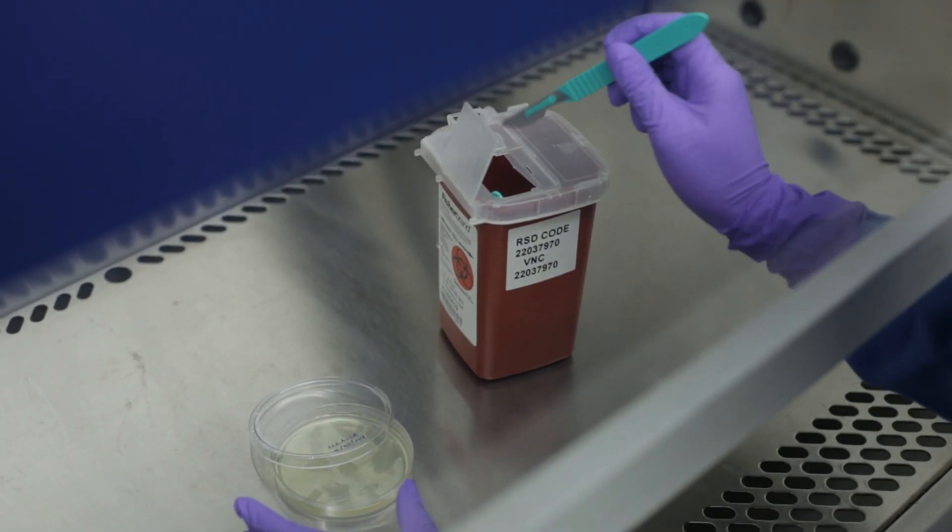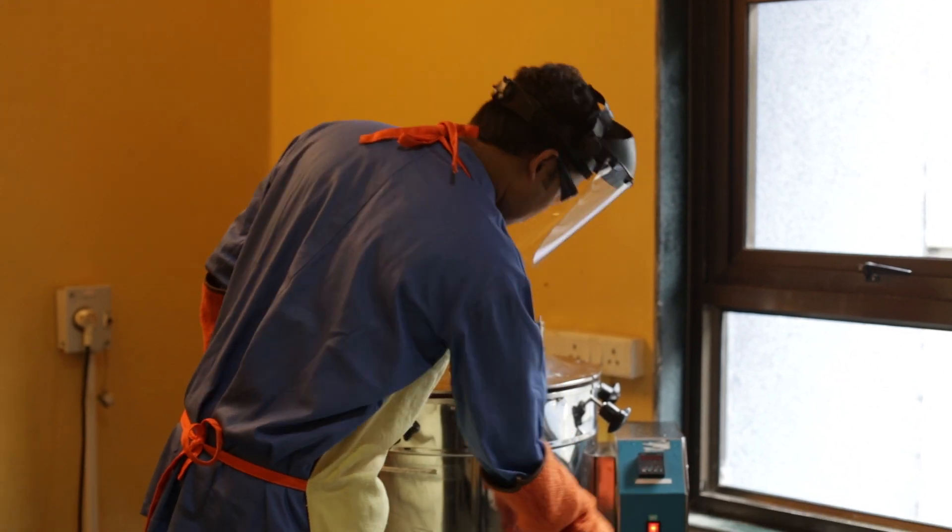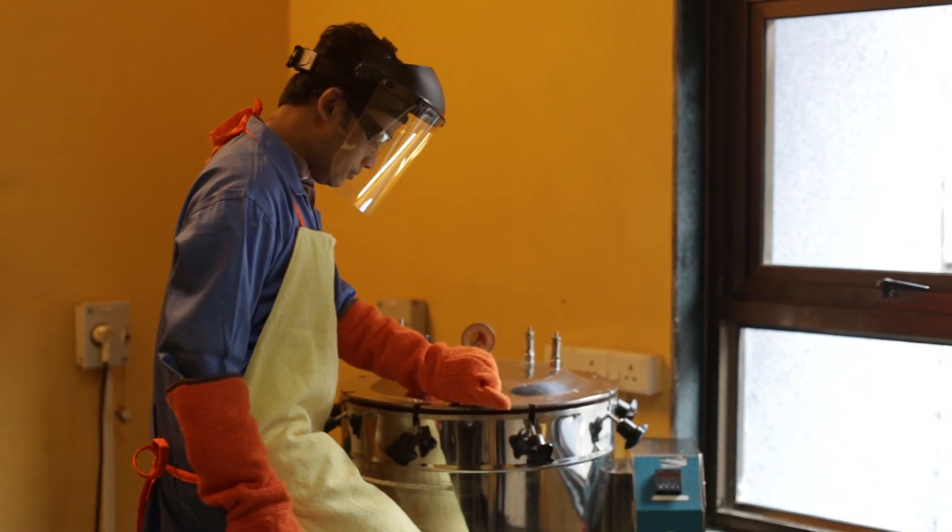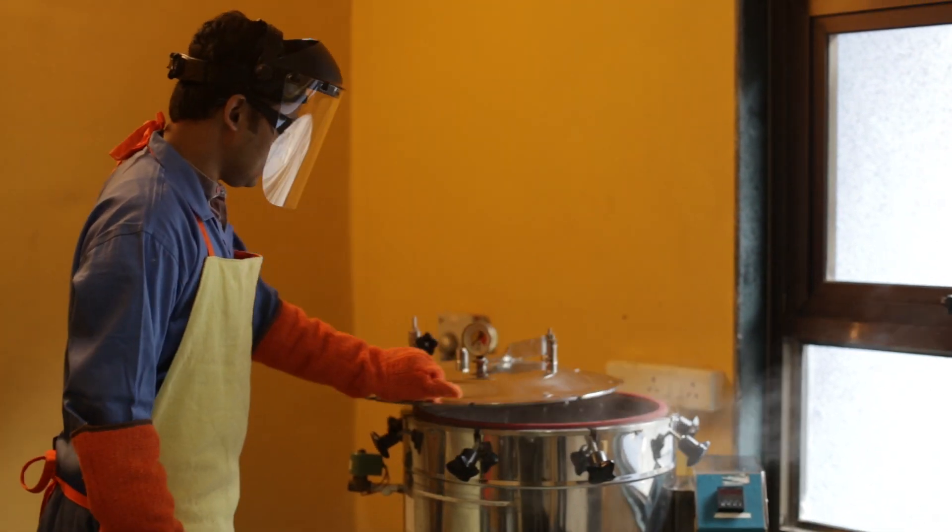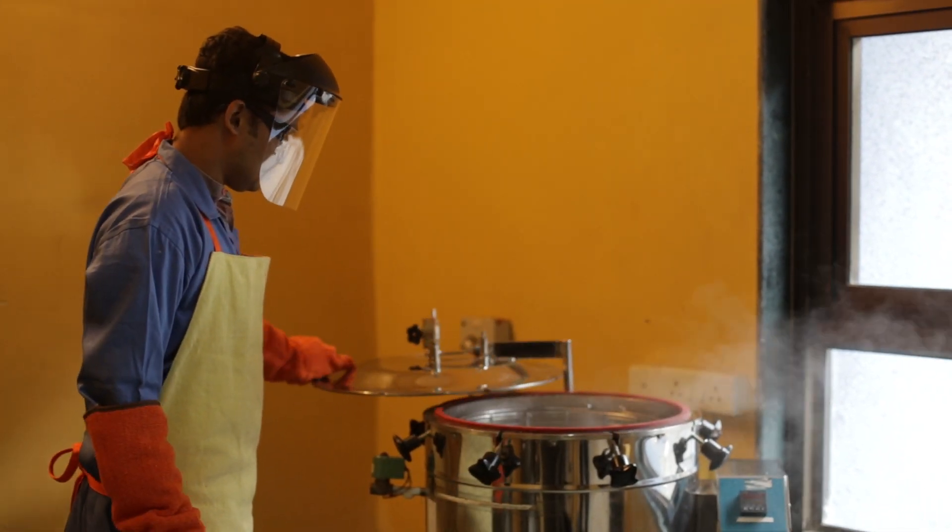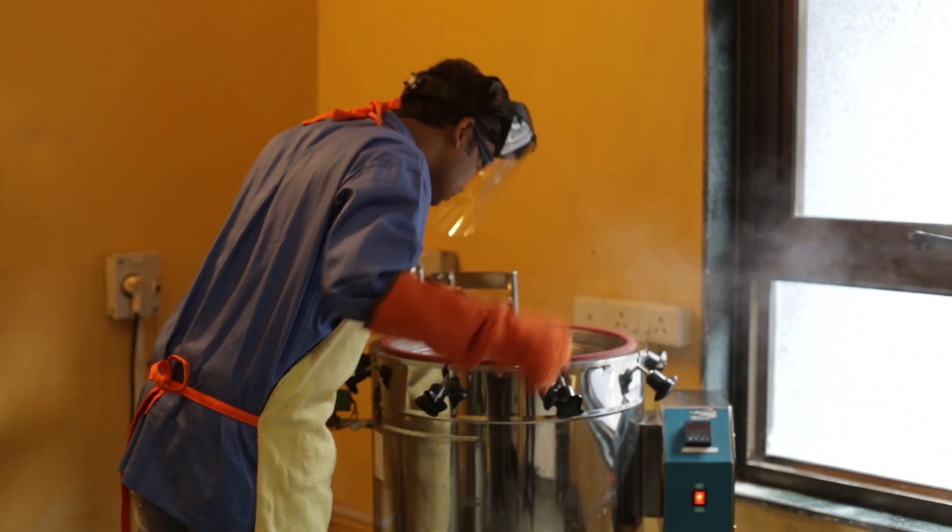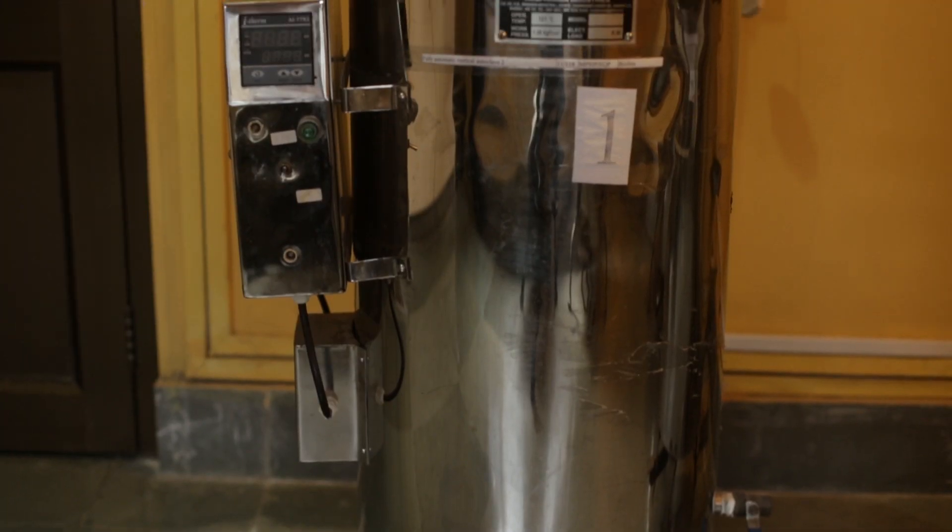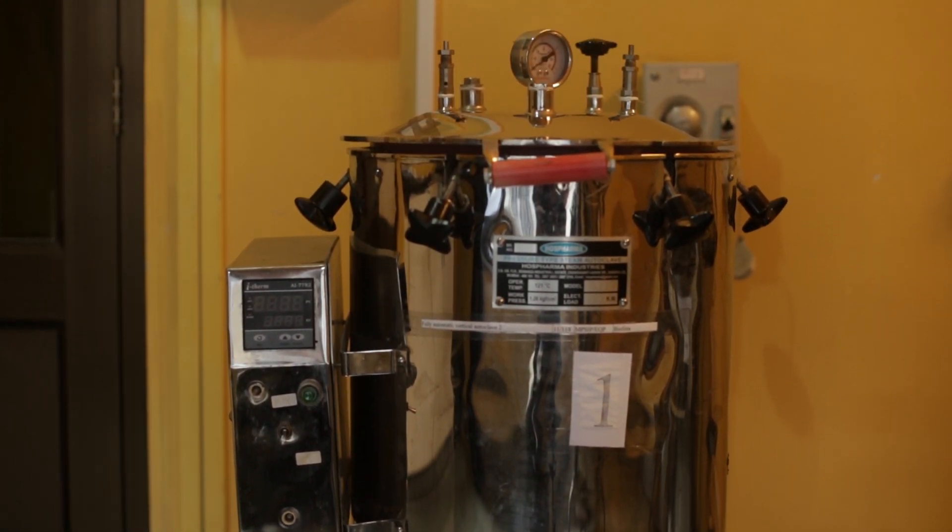Contaminated sharps must be collected in puncture-proof containers. All solid biohazard waste must be autoclaved before disposal. Autoclaves can cause serious injuries from steam exposure or rupture of containers. Use heat-resistant personal protective equipment while working with autoclaves. Store autoclaves in dedicated rooms.